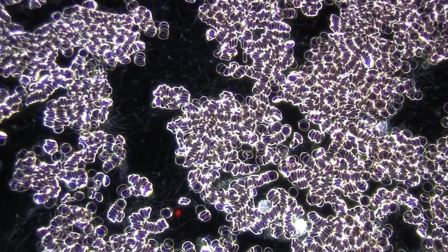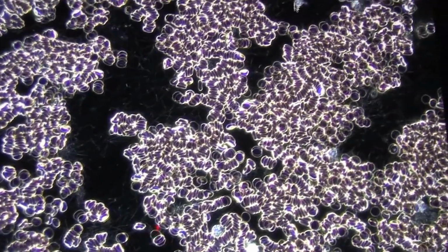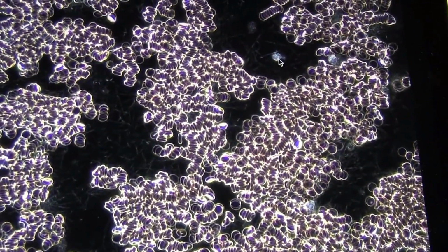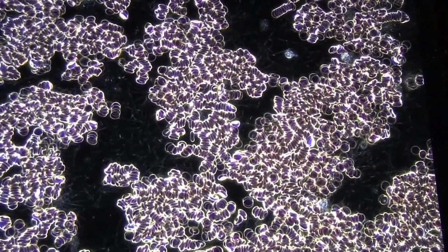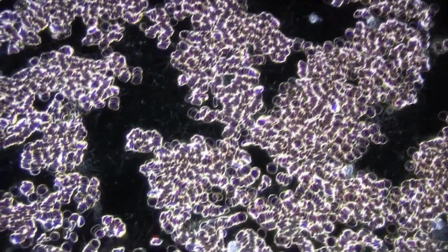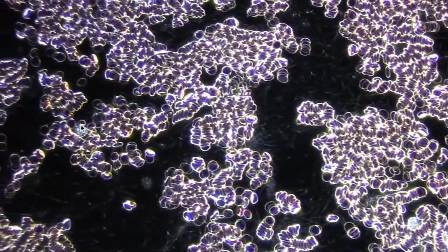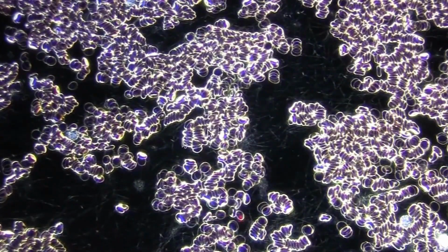Here we can see a very small white blood cell, actually. In the case of this blood sample, you can see this one here too. They should be 2 or 3 times the size of the red cells, and they're maybe about 1.5 times the size of a red cell. So they're not in ideal shape. This is the picture of a sample of blood I looked at within the last week.